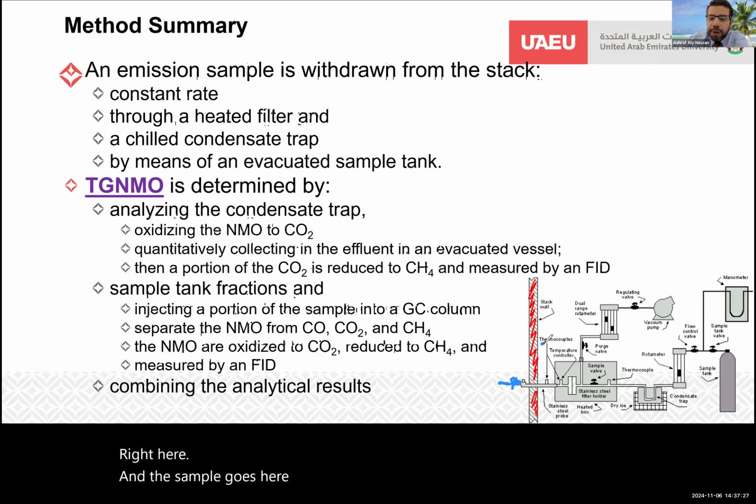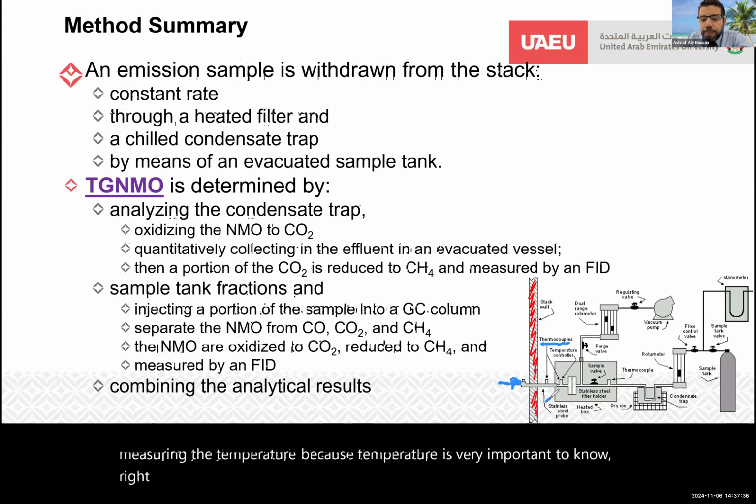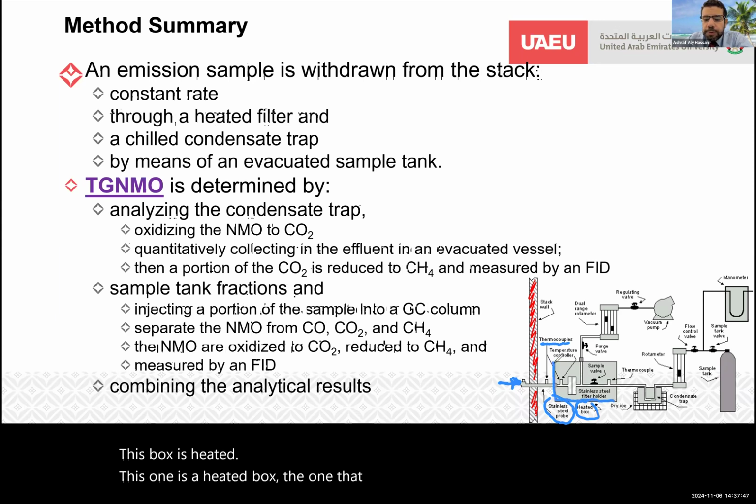This is a thermocouple. A thermocouple is used for measuring the temperature because temperature is very important to know. And usually the probe is a stainless steel probe. This box is heated. This one is a heated box, the one that I'm drawing right now.